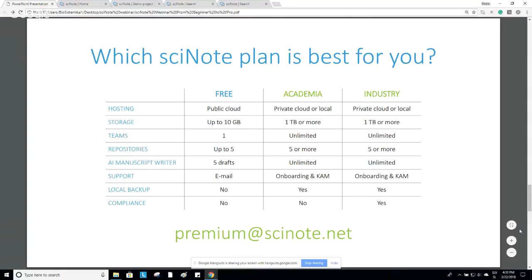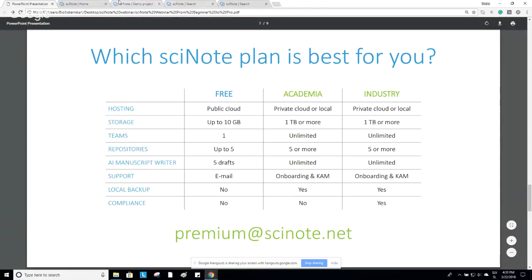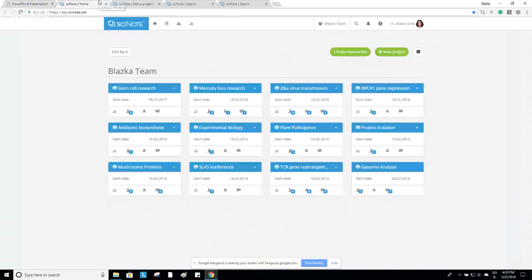We have another question. Thank you, Igor. So how are instruments registered in the app? There are predefined instruments available. So Blaszka can show you. We have a repository of the instruments, and Blaszka will now show you how this works.